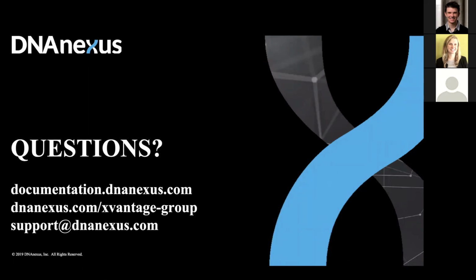Okay, great, thank you. And then the final question that we'll be able to get to live today, I know we have a couple others that we can follow up directly via email, but the final question is, are there any apps on the platform that are ready to use? So all the apps that we displayed in the tools list are ready to use. There's a lot of README information that's given on how to run the application, both on the UI as well as on the command line. There might be some applications which might be private to specific users, but all the public apps that you saw on the platform are ready to use.